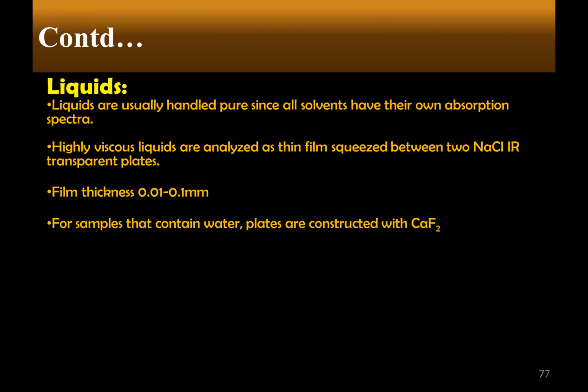For samples that contain water, plates are constructed with calcium fluoride, which is a little bit resistant.